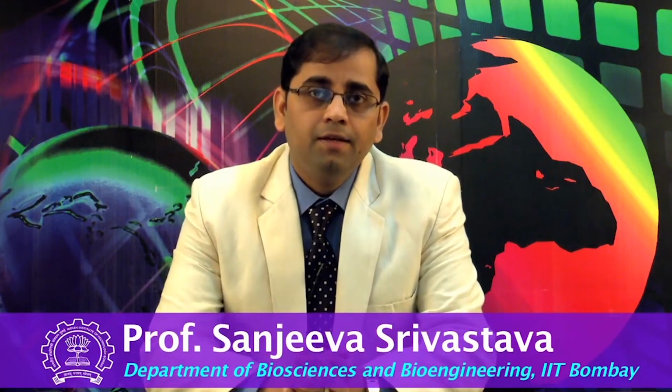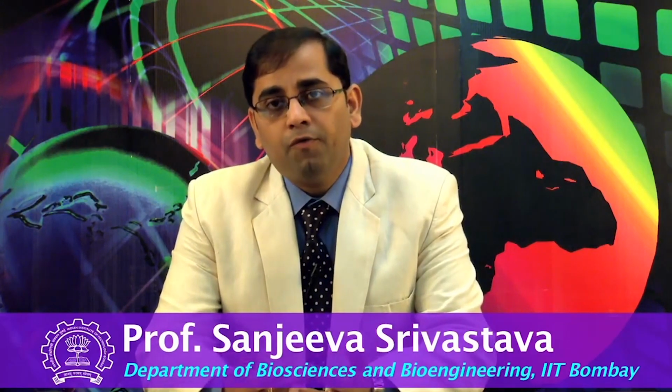Welcome to the MOOC course on applications of interactomics using genomics and proteomics technologies. In the last few lectures, you have seen how a technology platform like NAPA, nucleic acid programmable protein arrays, could be so useful to perform high throughput assays for the proteins without having the purified proteins available to you.